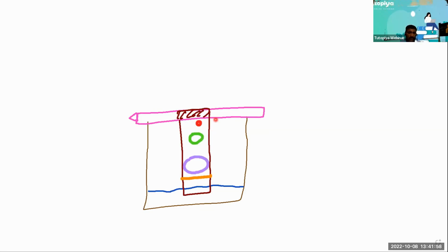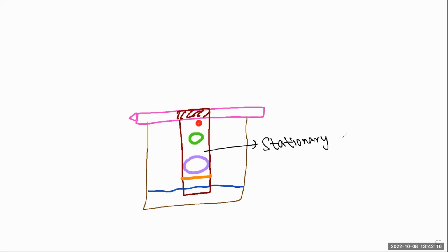But what's more, from your IGCSE practical point of view, is that they ask you, what are the 3 essential requirements of conducting a chromatography experiment? There are 3 things here, the first of which is called the stationary phase, because the paper is not moving. It's stationary. We call it the stationary phase.